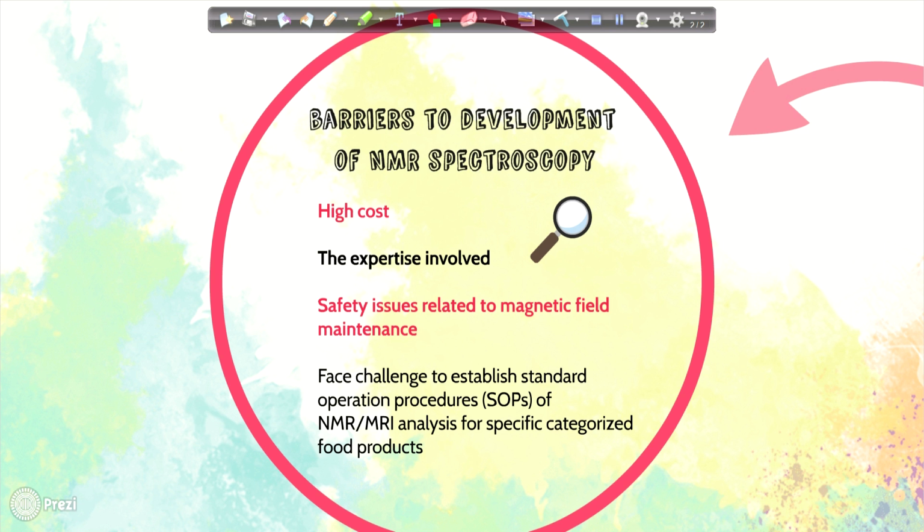Food researchers also face the challenge of establishing standard operating procedures of NMR/MRI analysis for specific categorized food products due to the complex nature of foods.